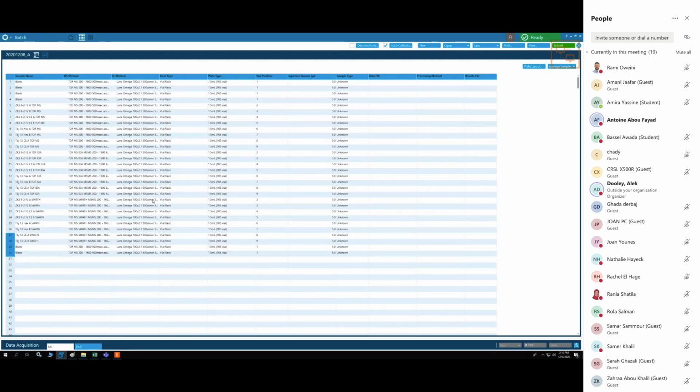So you can install in parallel up to 4 solvents, 2 for the A and 2 for the B. And you can choose those in your LC method. So you are able to run a batch with different gradients in it. That depends how long the tubing is. I'm not in the lab, so it's hard for me to judge.